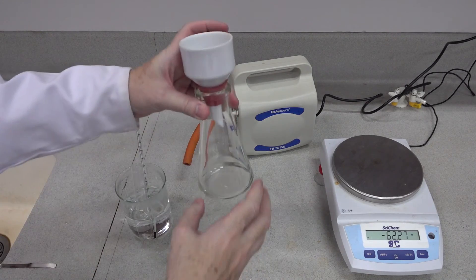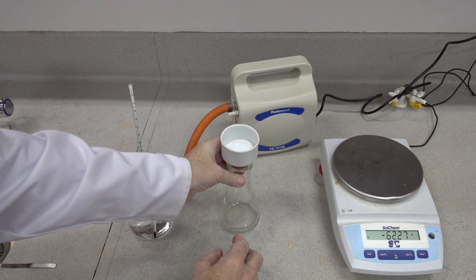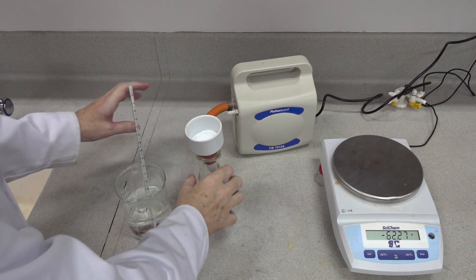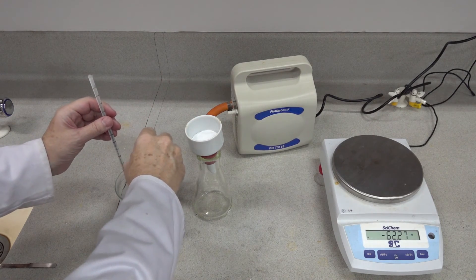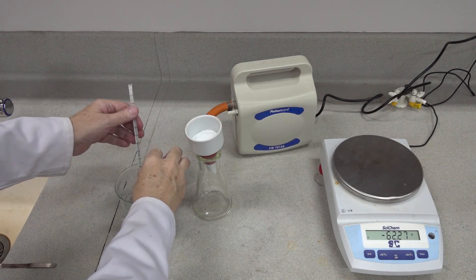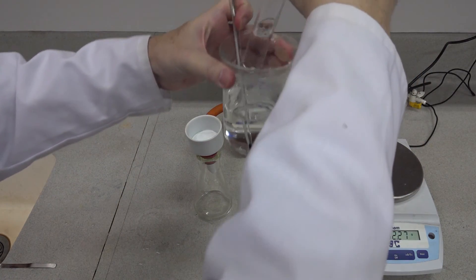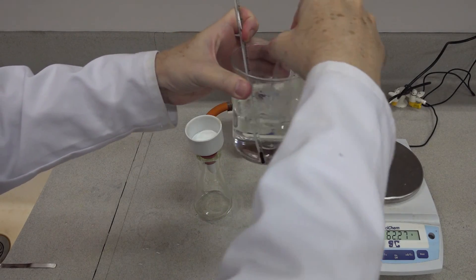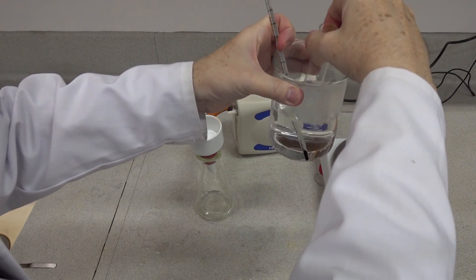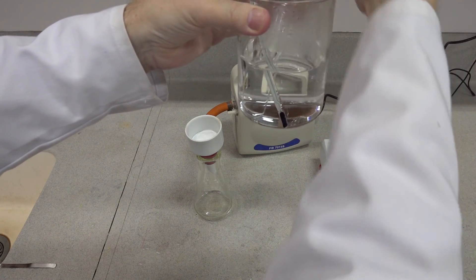We'll use a clean flask — a sidearm flask and funnel — in case we need to recover any of the liquid that passes through. Connect to the pump. Very nearly all dissolved; temperature is still 72 as we keep it in the water bath. And there — now it's totally dissolved. Let's just move the thermometer out of the way.